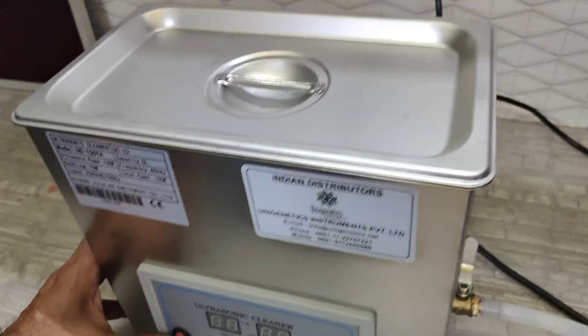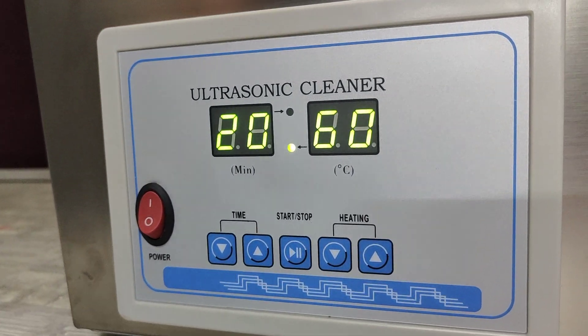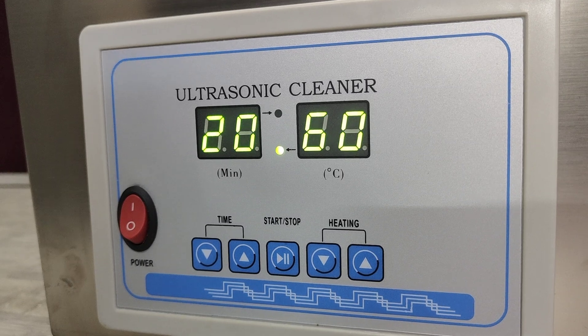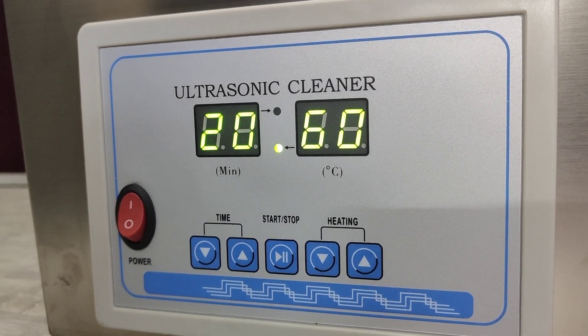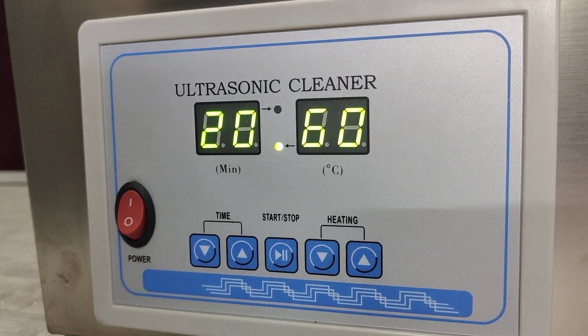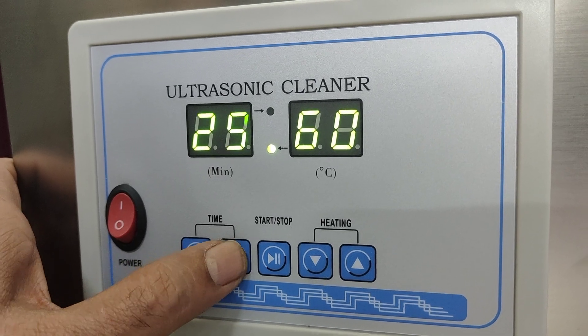Now I am giving power to the machine. There are only two parameters: one is time and the second is temperature. Time can be set up to 99 minutes and temperature up to 80 degrees centigrade.